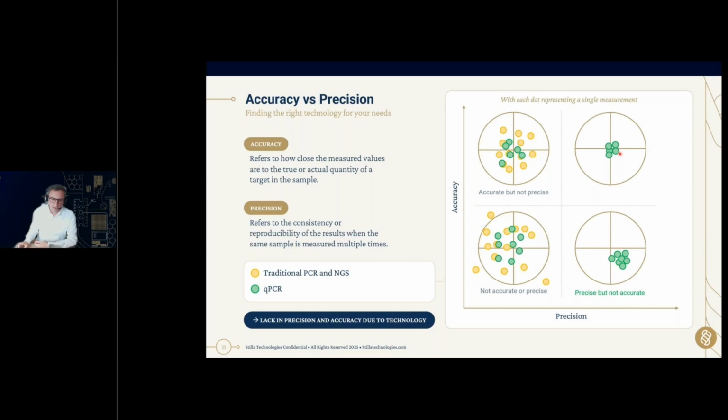But this includes that you also need a pre-PCR and post-PCR room inside of your lab, and that every time somebody does the same to get really good results. When you have fluctuating personnel, it can happen that, for example, I just remember from my students when they started doing PCRs, I ended up here and I had to repeat it. You know, there's a GMO inside, but you don't know exactly how much, because one time it's a CT of 38, the next measurement is a CT of 35, and it's in between of what it should be. And this only happens when we are measuring always the same proportion. I'll come back later to that.